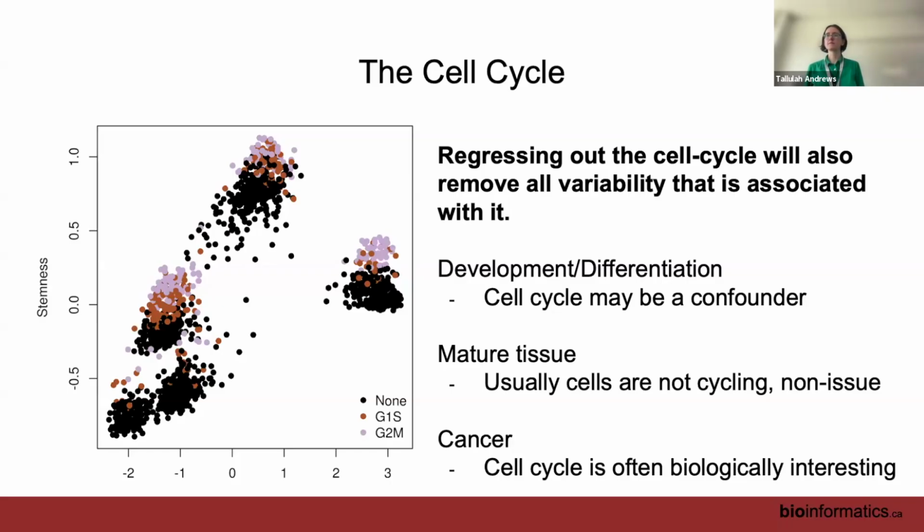Okay, great, thank you. And I see that there are a couple other questions coming in that it might be worth addressing before we move on. Yep, I'll pause. So we have another question from you, Ottawa. Can we consider covariates for normalization in SCTransform? For instance, studying the design matrix.